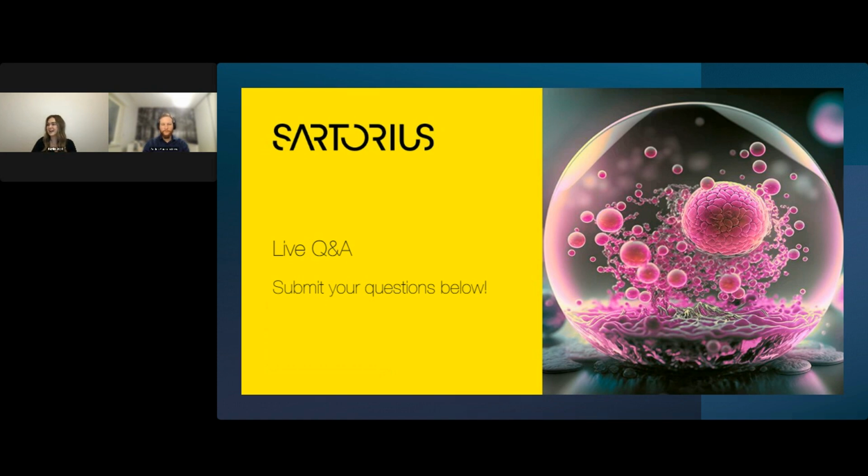Andris, this first question asks, is it possible to select organoids using multiple fluorescence channels? Yes, there is a possibility to select multiple fluorescent channels in addition to morphological parameters using the Cell Selector platform, as these kinds of features are inbuilt in the software itself.